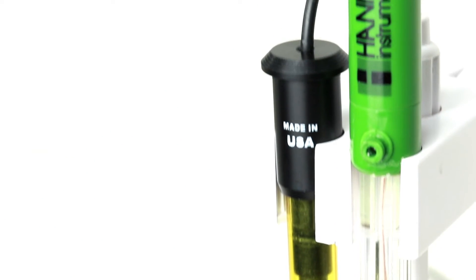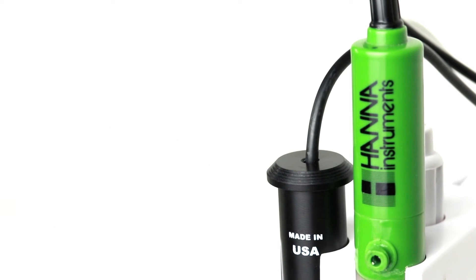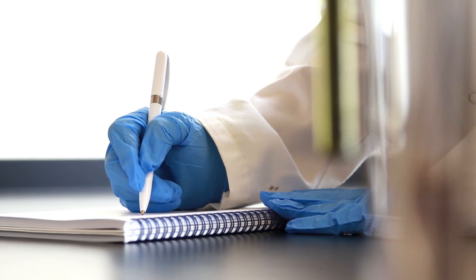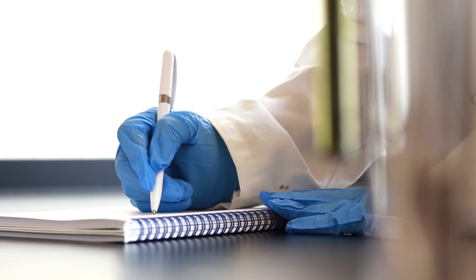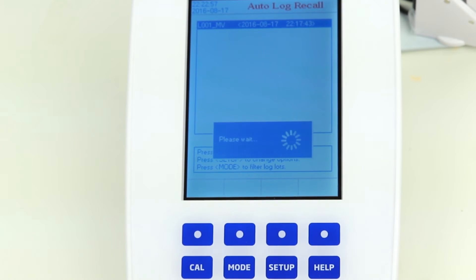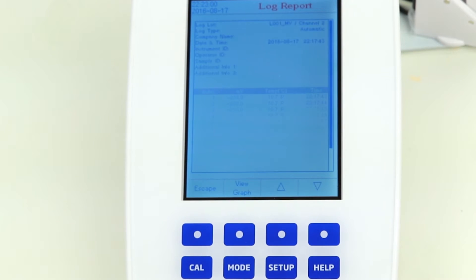The HANA HI5222 dual-channel is also one of the few benchtop meters available with built-in incremental methods for ion-selective electrodes, commonly known as an ISE. With this method, you can achieve higher accuracy while avoiding the calculations involved. Further, a detailed report is available for all data, ensuring traceability.